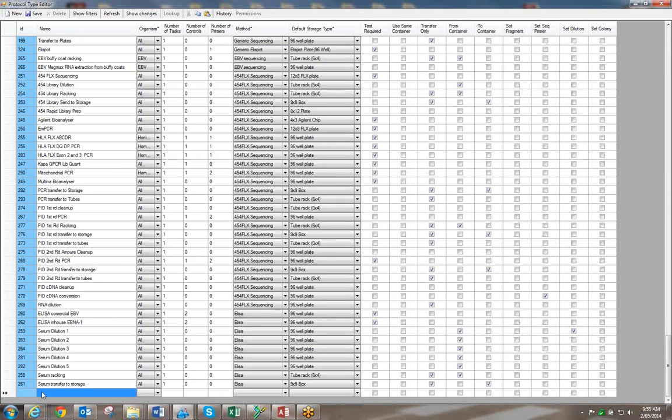So do you have any protocol in mind that you want to create, Silvana or Rama? Can you think of one? Can you do an ELISA one? Okay, let's do an ELISA for the P24, okay? Perfect, yeah. So we'll do that.